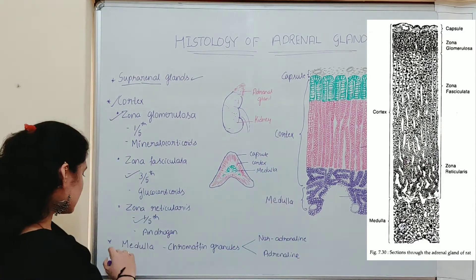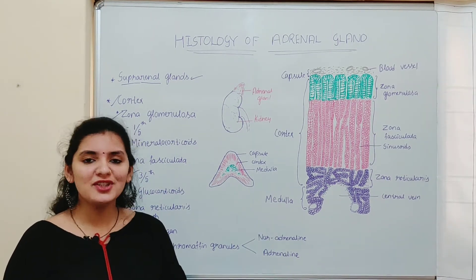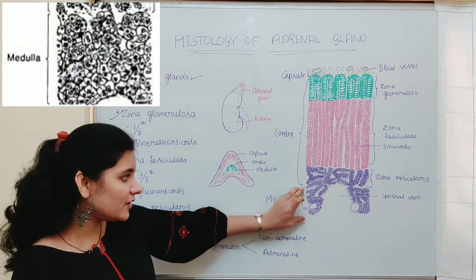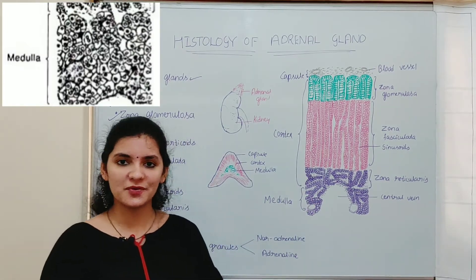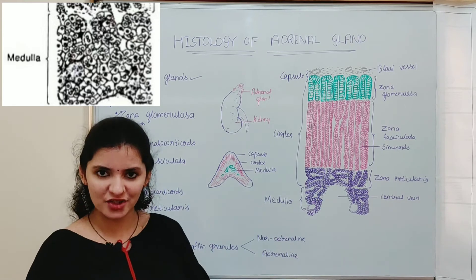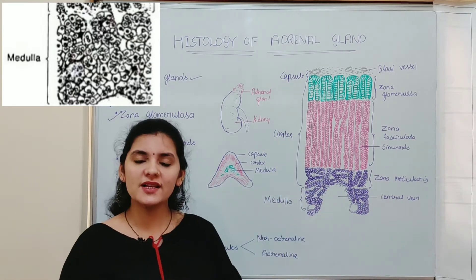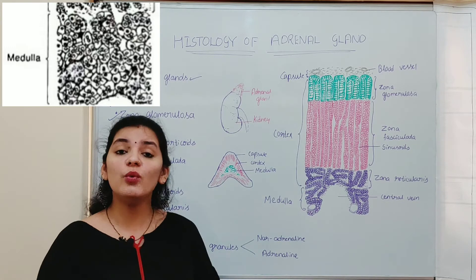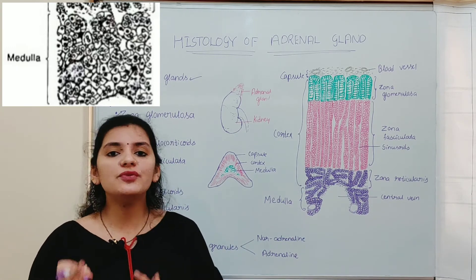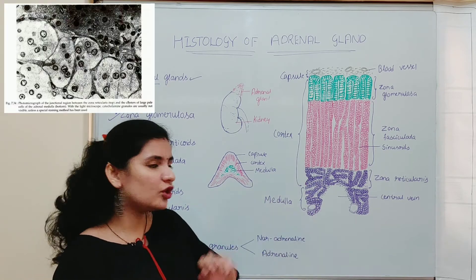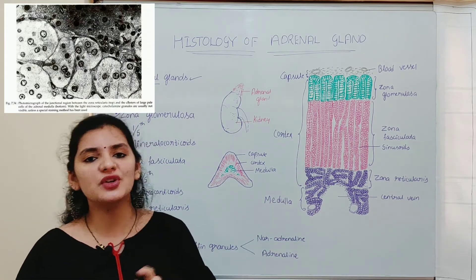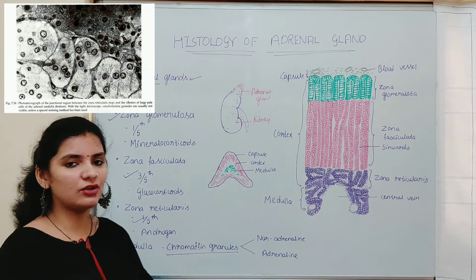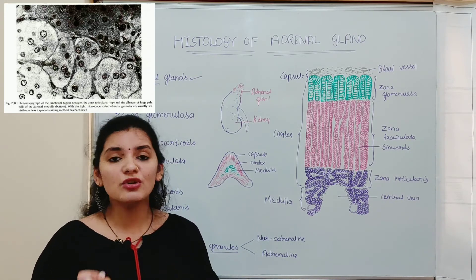The next region is the medulla, also called the suprarenal medulla, which is the innermost region of the adrenal gland. The medulla is made up of cords or columns of polyhedral or cuboidal cells arranged in acinus groups, with sinusoids found in between. Some of these cells have specialized granules called chromaffin granules, and those cells are called chromaffin cells.